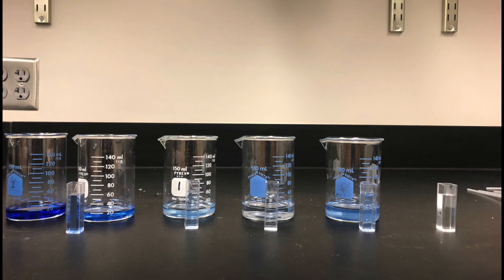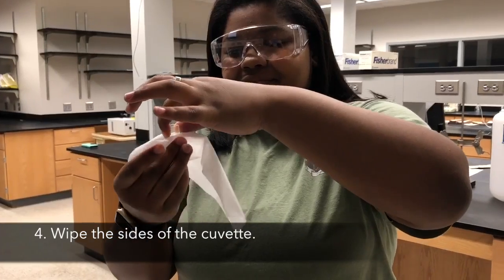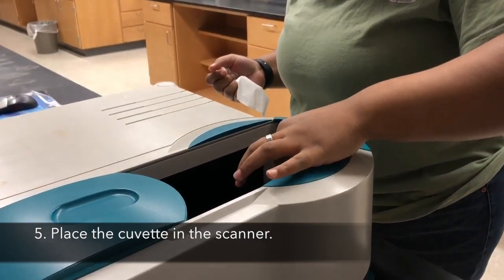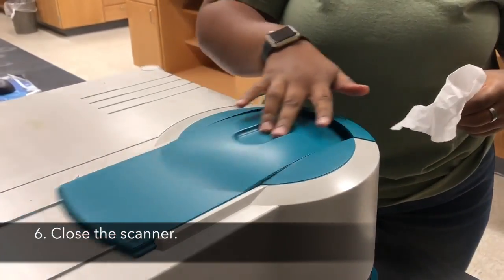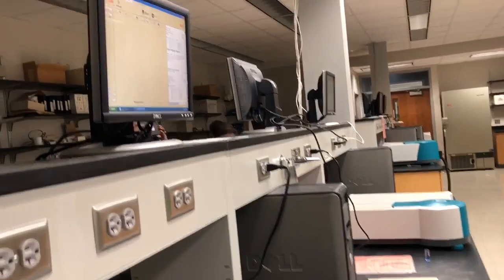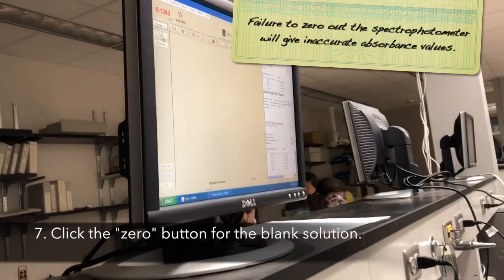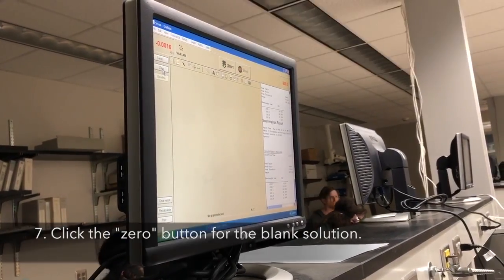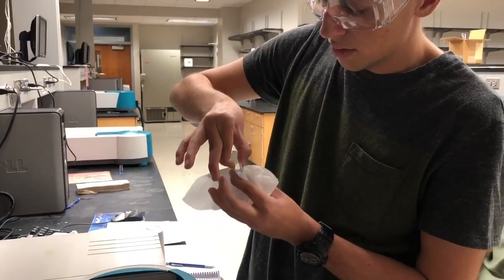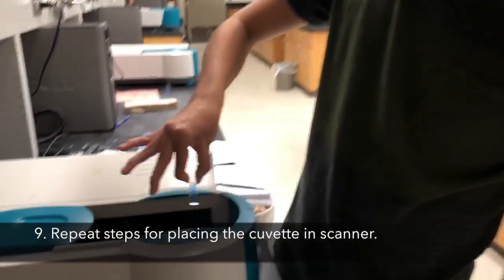Once you have your cuvettes, you are ready to move into the spectrophotometer room. To begin, wipe the sides of the blank cuvette that the light will pass through. Place the cuvette in the scanner, and then close the lid. Then click on 0. Zeroing out the spectrophotometer calibrates it and creates a baseline response. Remove the blank, and now you can begin scanning the rest of your dilutions.